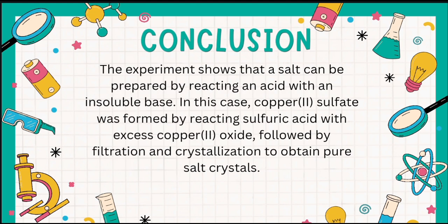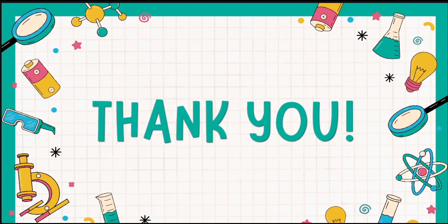In conclusion, the experiment shows that a salt can be prepared by reacting an acid with an insoluble base. In this case, copper sulfate was formed by reacting sulfuric acid with excess copper oxide, followed by filtration and crystallization to obtain pure salt crystals.